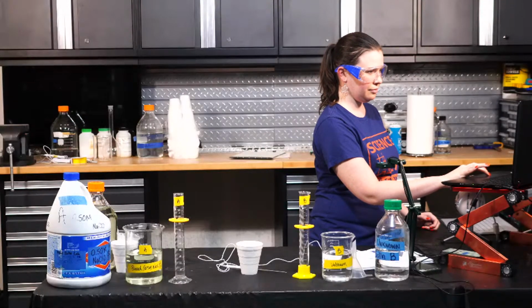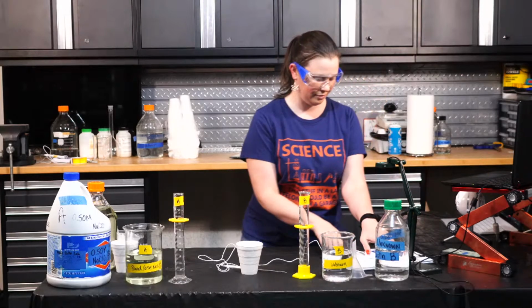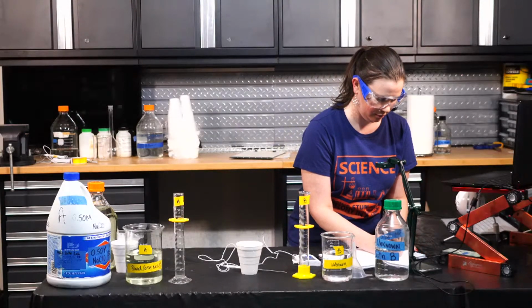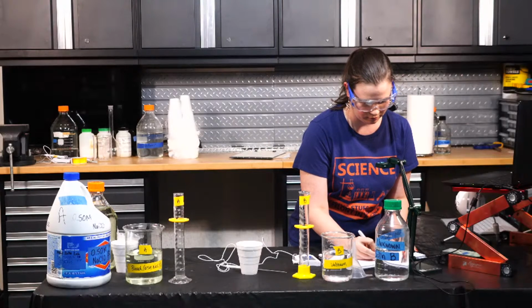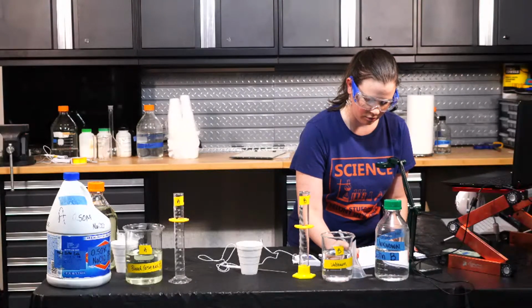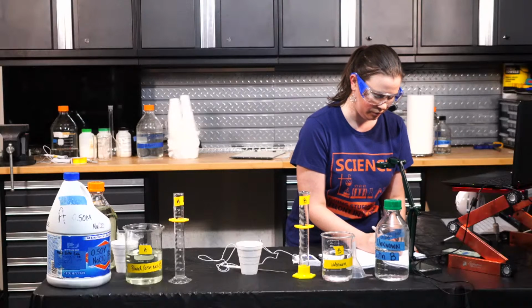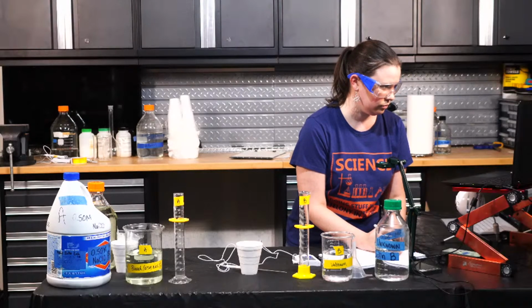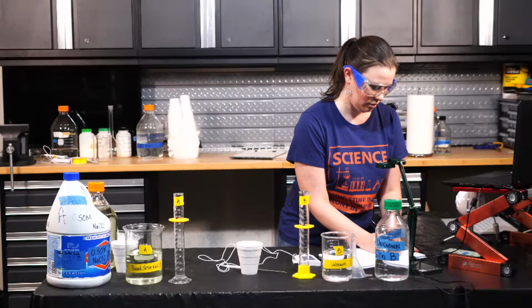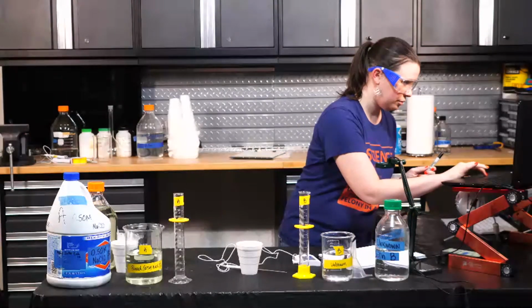Hi. Okay. So we came to a consensus. We decided on doing 5, 15, 25, 35, and 45 milliliters of bleach for our levels of independent variable. Okay, so then how much of the solution B? If we're keeping the volume at 50 consistent, up to you then, guys. If it were 5 milliliters of bleach, then 45 of solution B, and so on. Not and so on, you tell me.